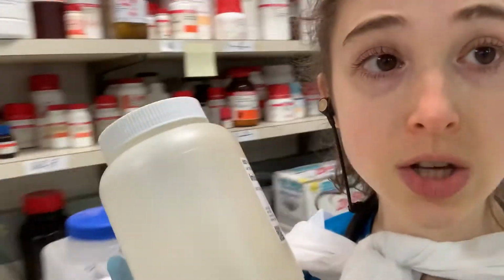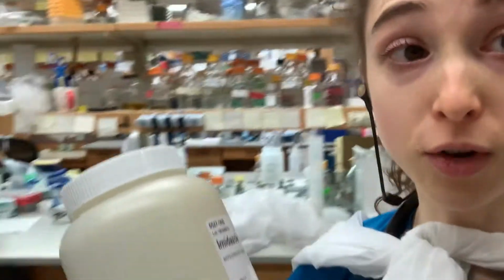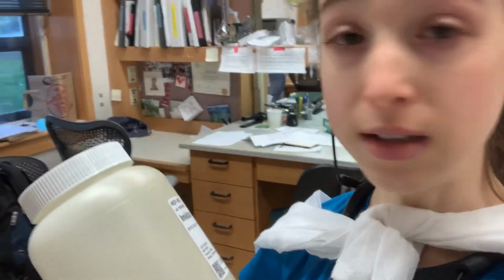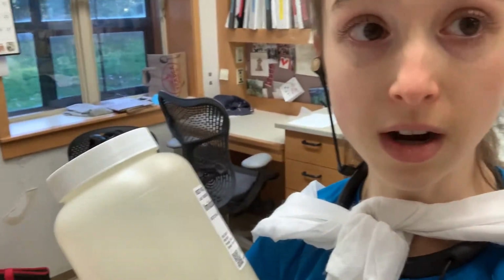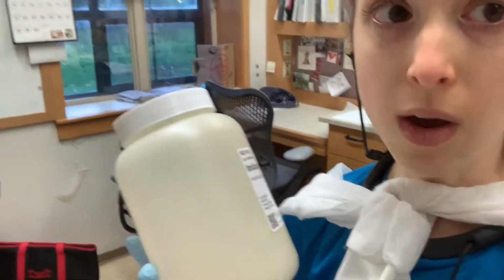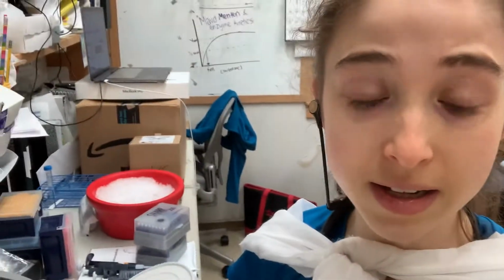So for imidazole, we have a molecular weight of 68.08. So if I weighed out and dissolved 68.08 grams of imidazole and then dissolved it up to 1 liter of volume, I would get a 1 molar solution. If I wanted 2 molar imidazole, I would double that. And so I keep a cheat sheet of things that I make a lot, with the various amounts to add already calculated.